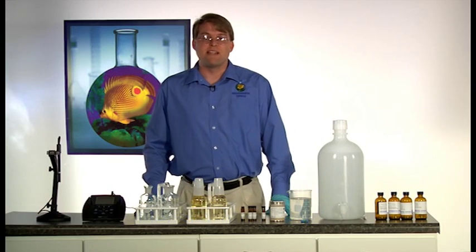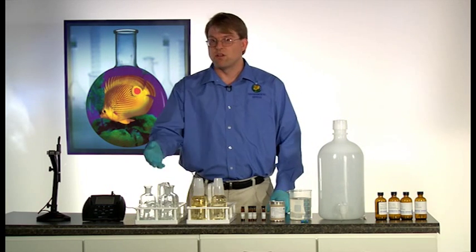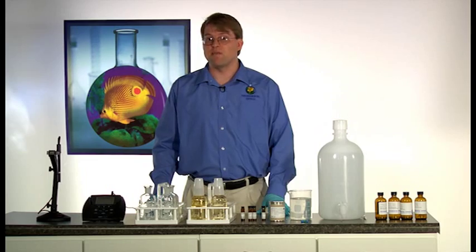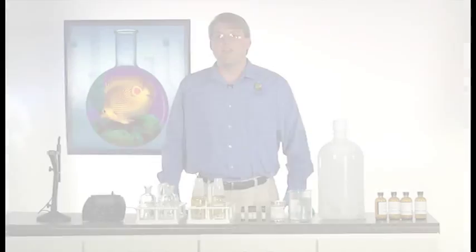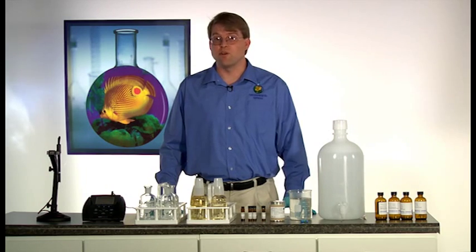Environmental Express provides everything you need for a successful BOD batch from the dilution water reagents to the bottle. There is also a full line of incubators from 3 to 27 cubic feet available for use. Thank you for joining us for Environmental Express Tech Tips. My name is David and I appreciate the opportunity to earn your business.